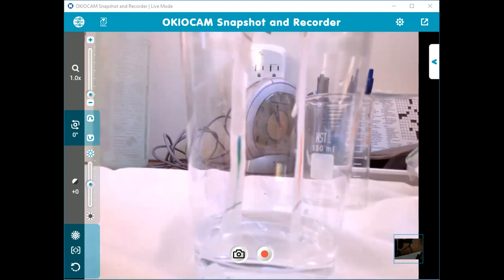The actual water line is what you need to mark, and it probably won't be the same.